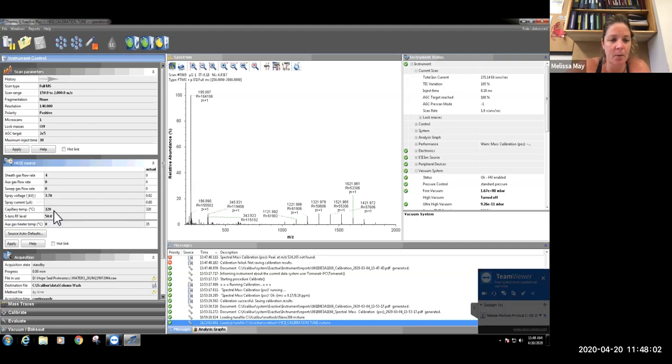The capillary temp, we also change. One of the things I'll go over is how to change the ion transfer tube, which is the tiny little tube that the sample gets injected in. You actually have to remove that from the instrument. When you do that, you don't want to have the temperature of that at 320 degrees. One, because it's metal and it would bend, but two, also because it increases the chance that you would burn yourself. So if you were going to do that, one thing you would do is just change the temperature down to 100. You'll notice when I type this in that nothing's actually happened yet. This program has it built in as a safe point where you have to actually say you want to do something, and then it's going to basically be like, are you sure?